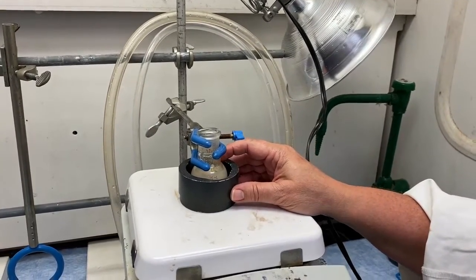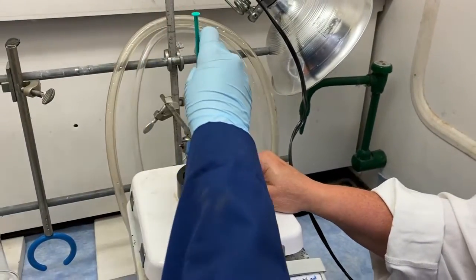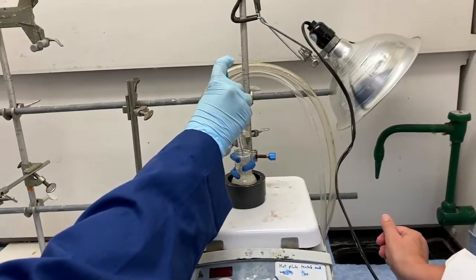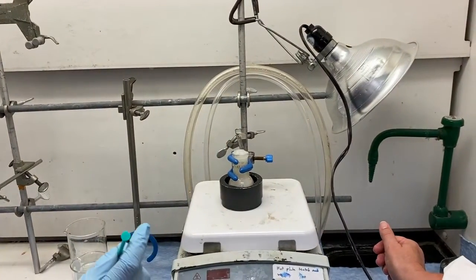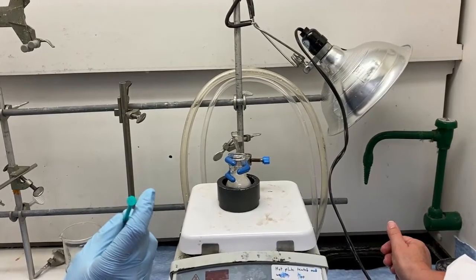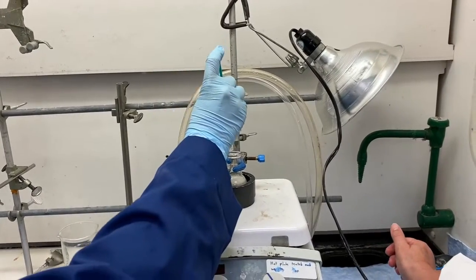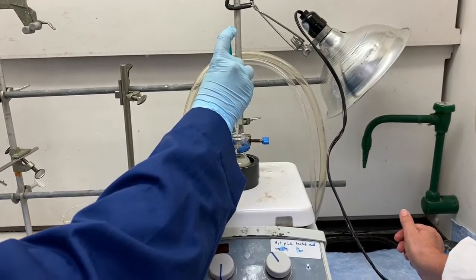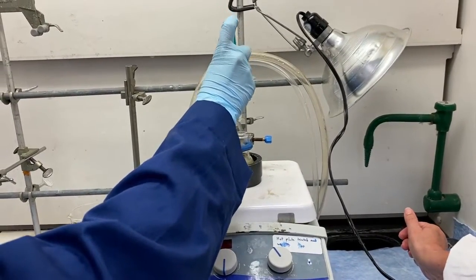And so now we're going to add our source of proton, from acetic acid. Karen's adding this now slowly. We have some unreacted sodium borohydride in there, obviously, so a little bit of hydrogen gas formation, which is kind of cool, as long as it's under control and doesn't screw up the last hour of your life.